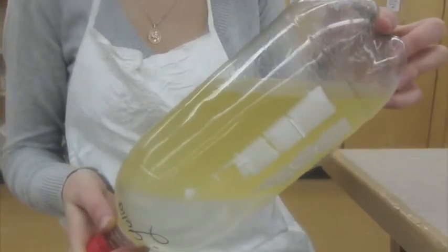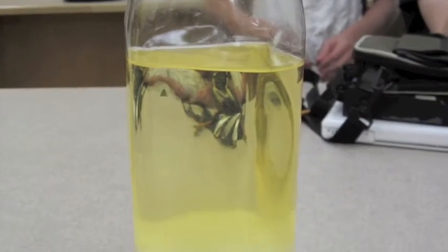Step 11: Repeat steps 9 and 10. Step 12: Repeat steps 9 and 10, but instead of rotating the bottle, vigorously shake it for 30 seconds. Step 13: Let the mixture settle for a couple of weeks.